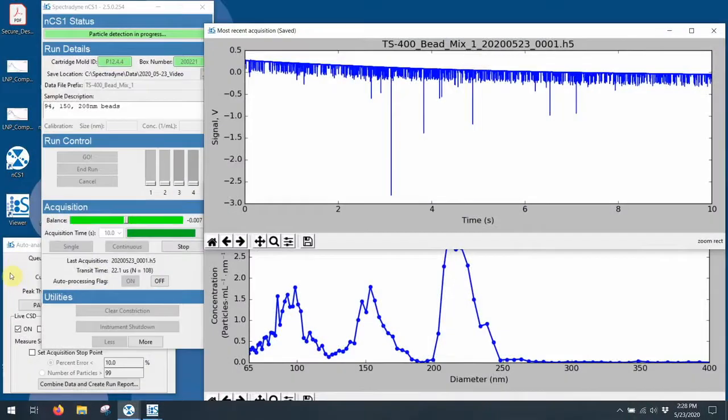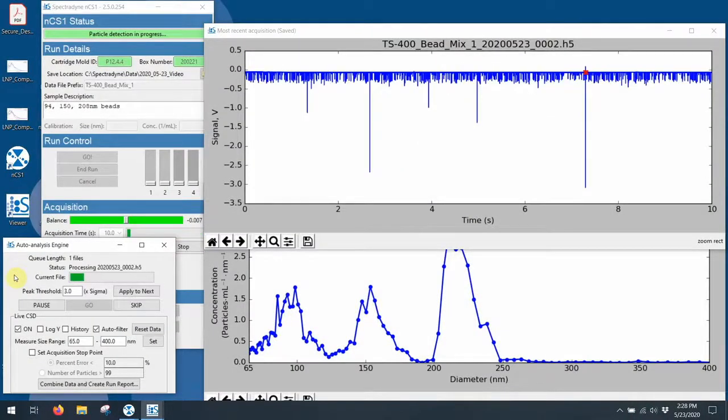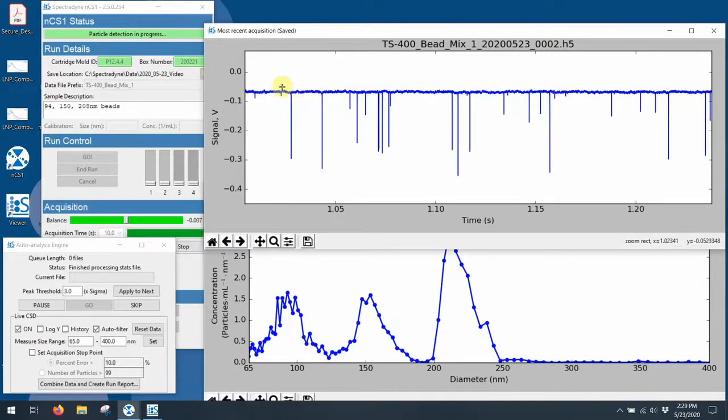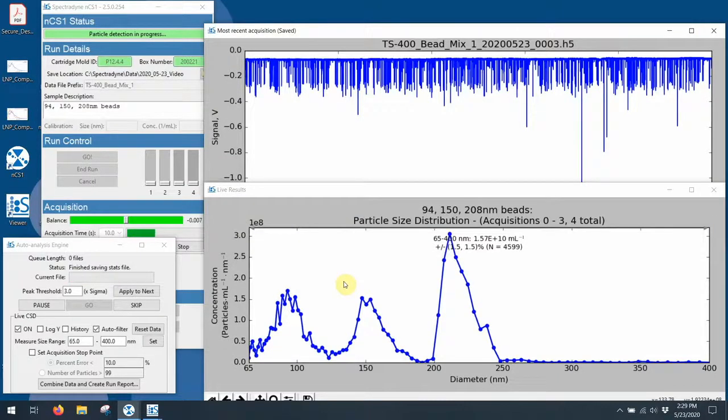So here's what this looks like in real time. The upper right window shows the raw data, which is processed and then turned into the particle size distribution in the lower right-hand window. We can zoom in and see the individual spikes that were made by the particle transits. Note that both graphs are updating in real time.